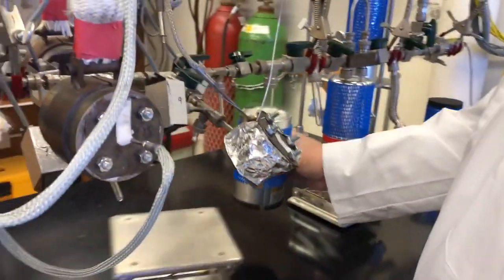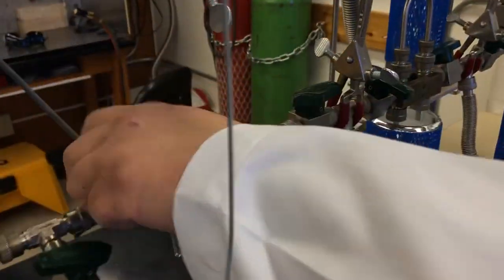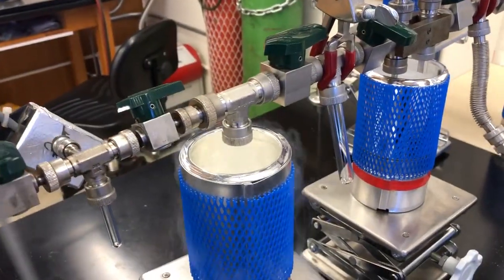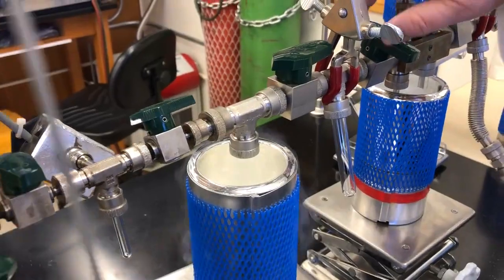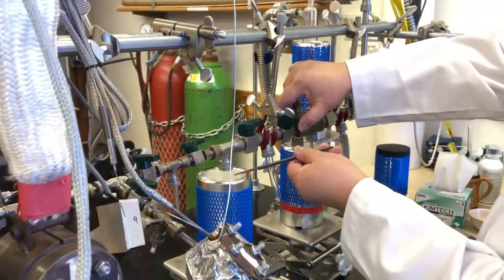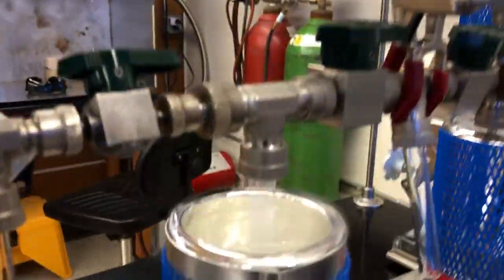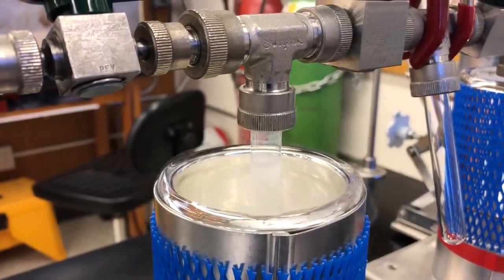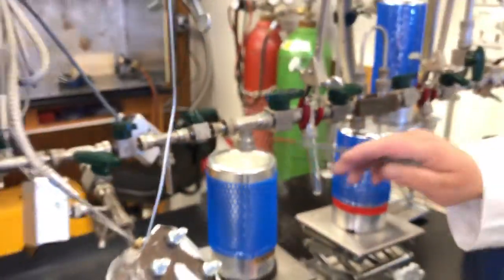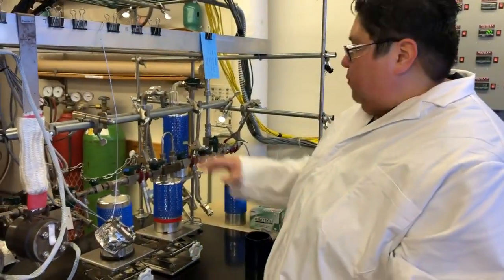Now I can put this liquid nitrogen onto another cold trap. We'll let it calm down a little bit. And when I open up the valve, right in here we should see a nice little pellet form. I don't know if you caught that, but that's our sample right in there. So this is cold enough to actually freeze the CO2 and separate it from the water vapor that was frozen out in this trap.